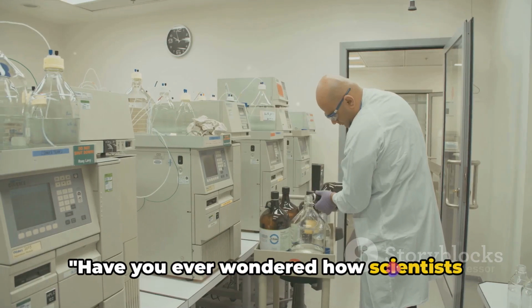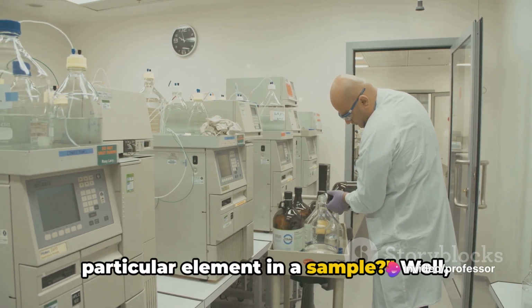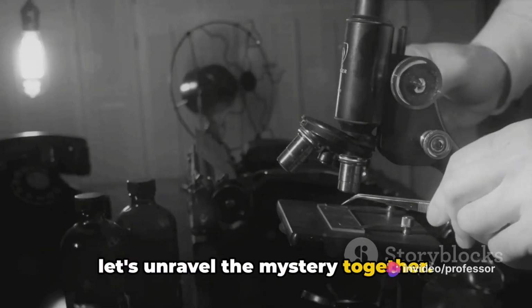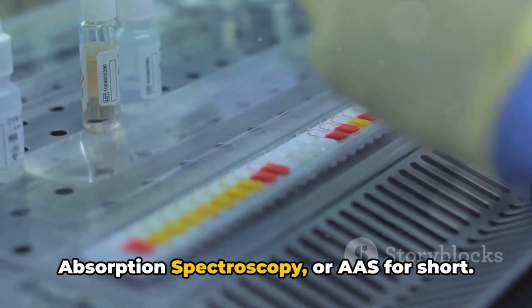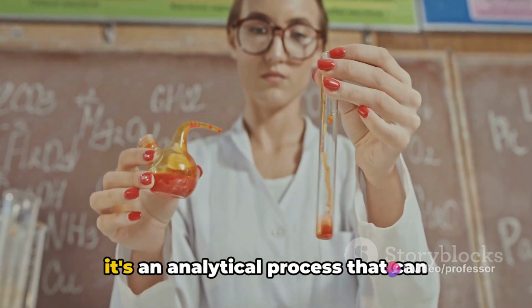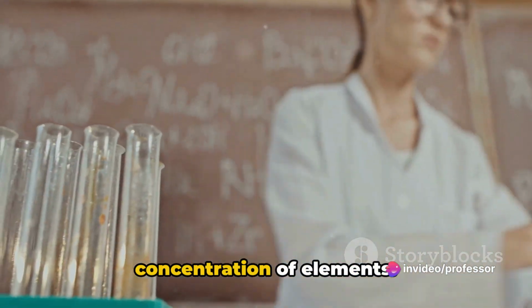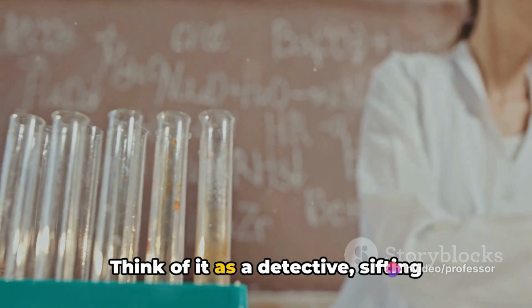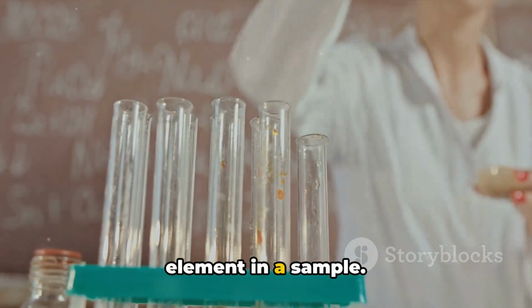Have you ever wondered how scientists determine the concentration of a particular element in a sample? Well, let's unravel the mystery together. They use a technique known as Atomic Absorption Spectroscopy, or AAS for short. This is not just any ordinary process, it's an analytical process that can accurately and precisely determine the concentration of elements. Think of it as a detective, sifting through the clues to find that one unique element in a sample.